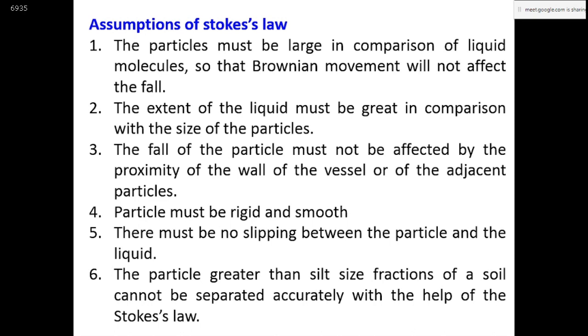Particles must be rigid and smooth. That is another assumption. There must be no slipping between the particle and liquid. Also, particles greater than silt size fraction of the soil cannot be separated accurately with the help of Stokes law.